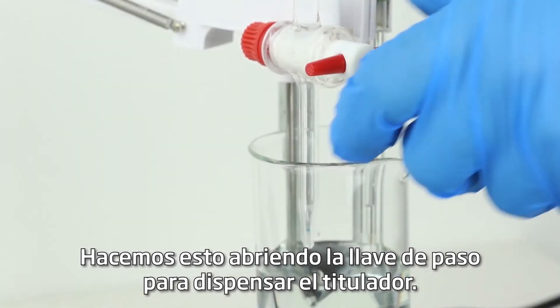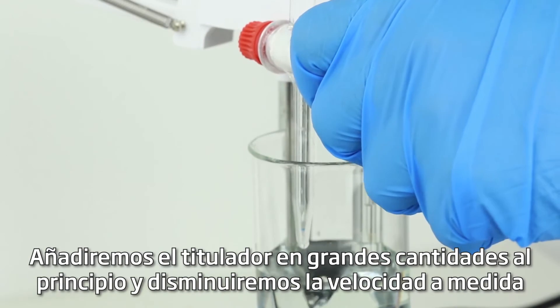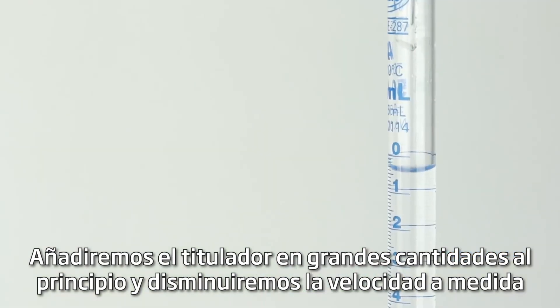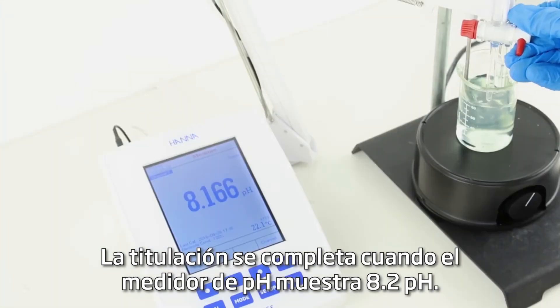We do this by opening the stopcock to dispense the titrant. We'll add the titrant in larger quantities in the beginning and slow down as we approach the endpoint. The titration is complete when the pH meter displays pH 8.2.